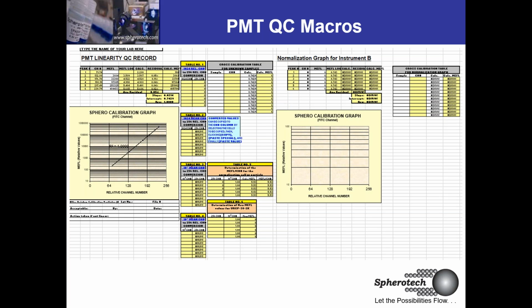For some of us, we might say, well, what if now I want to determine an unknown sample? I want to determine the brightness of an unknown sample. And in fact, I have a juvenile and I have a mature cell line. And I want to know if the expression of a specific surface marker is more prevalent on the mature or the juvenile, or can I say something significant therein? Yes, that's the power of these beads at the end of the day, being able to do unknown population brightness determination. Now, we're not going to necessarily be using an absolute value, because these are all correlative values.